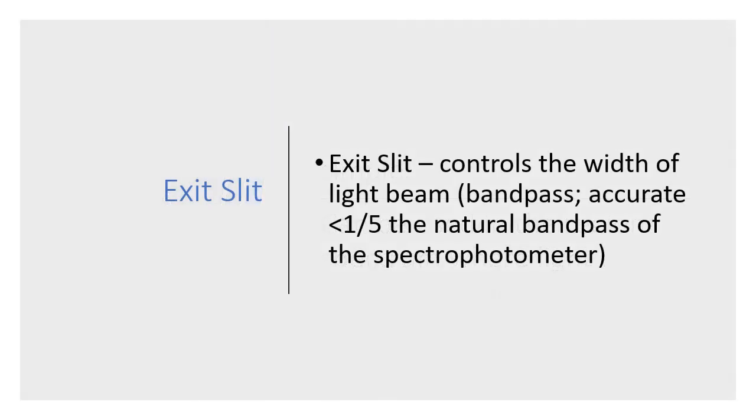Now, the exit slit controls the width of the light beam, which is termed as the bandpass. Okay, so, for example, ito yung light source. May entrance slit tayo dyan. Meron tayong monochromator. Anong trabaho ni entrance slit? To remove outside light from reaching the monochromator. Sa exit slit naman, it's there to make sure na yung isolated wavelength natin ay nasa tamang intensity. Okay? Or otherwise known as your bandpass.